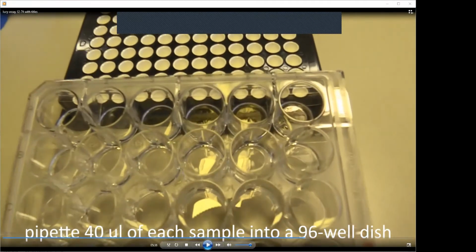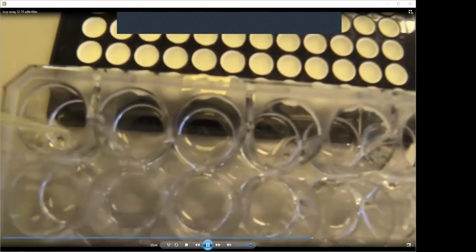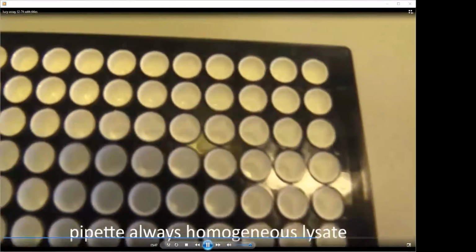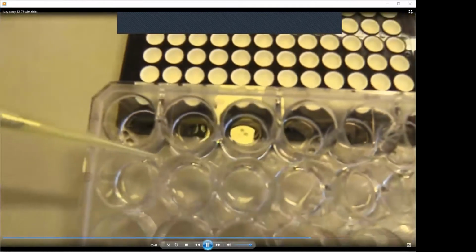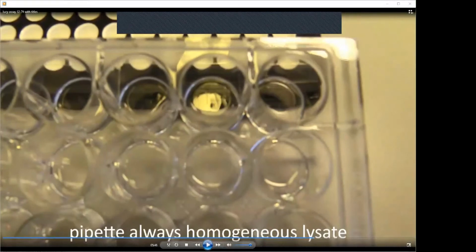Then you take, we have used 100 microliters for the lysis, and you remove 40 microliters of each sample and put it into the 96 well dish. So each sample is naturally measured separately. So we have triplicates, always 3 samples with the same treatment, which should have more or less the same value. Here I have also written that it has to be properly homogenized, so you have to pipette it up and down several times in order to get the same quality of the lysate.